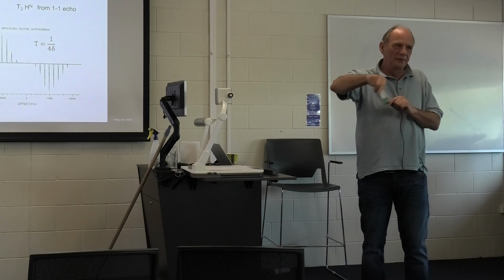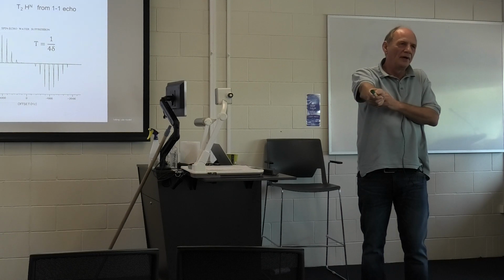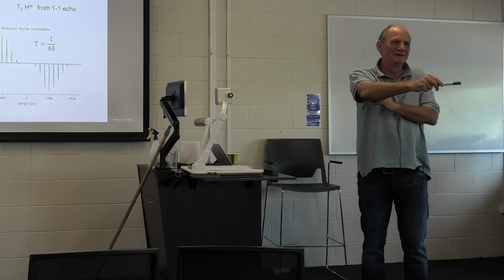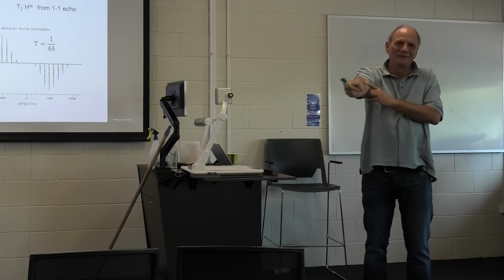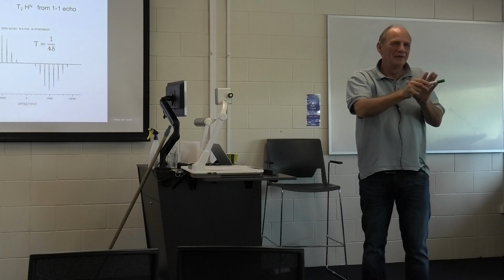You rotate with 3 ppm, depending on your spectrometer frequency, and now you go from minus Y to plus X. So now you can just wait until you have reached 90 degrees, and you can calculate this roughly for the region around 8 ppm.